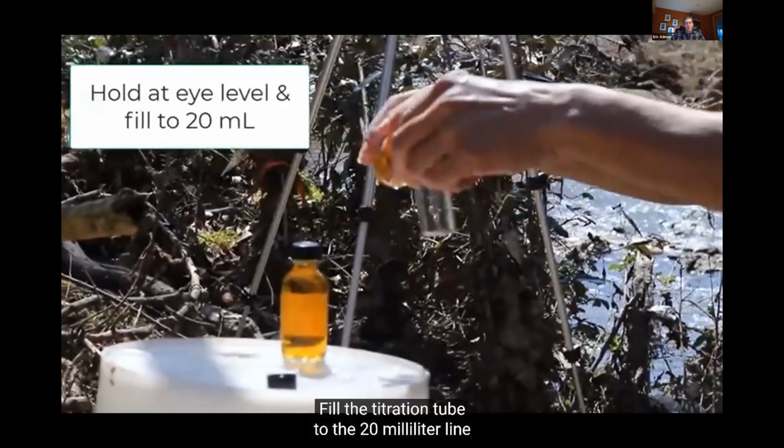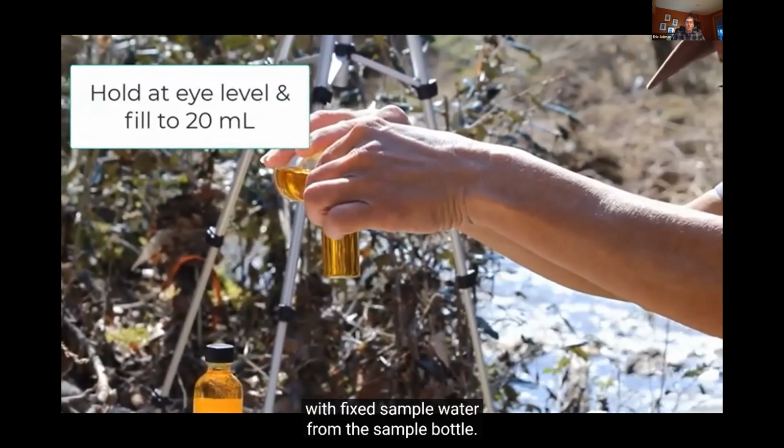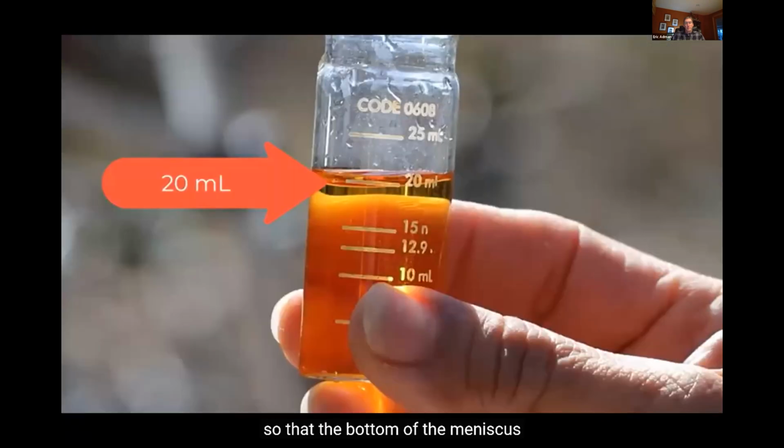Fill the titration tube to the 20 milliliter line with fixed sample water from the sample bottle. If you overfill, you can carefully flick the excess sample water into the waste bucket or onto vegetation so that the bottom of the meniscus is touching the 20 milliliter line.